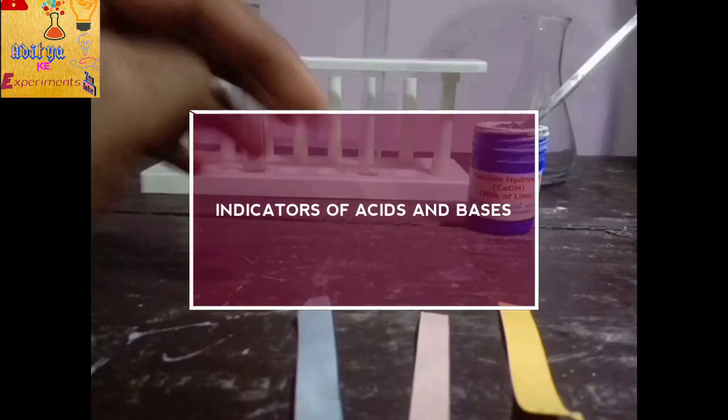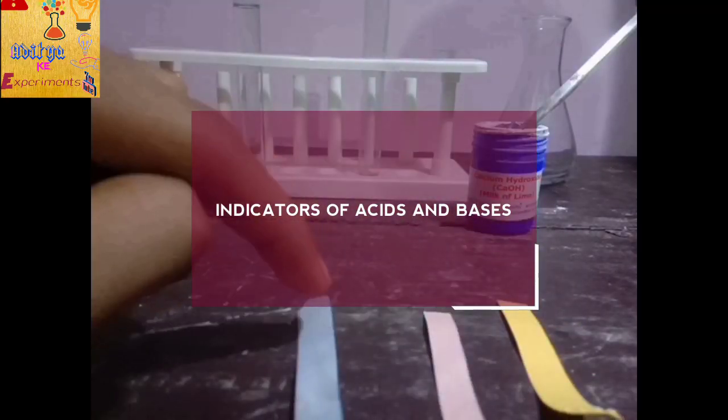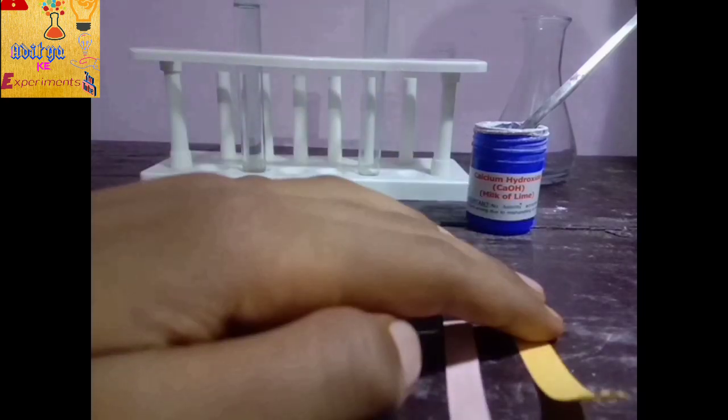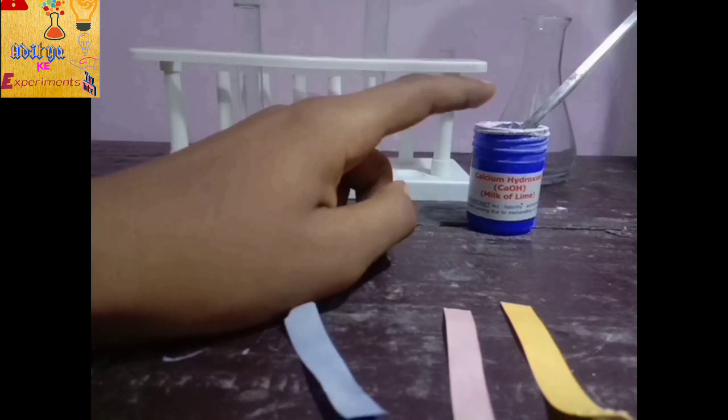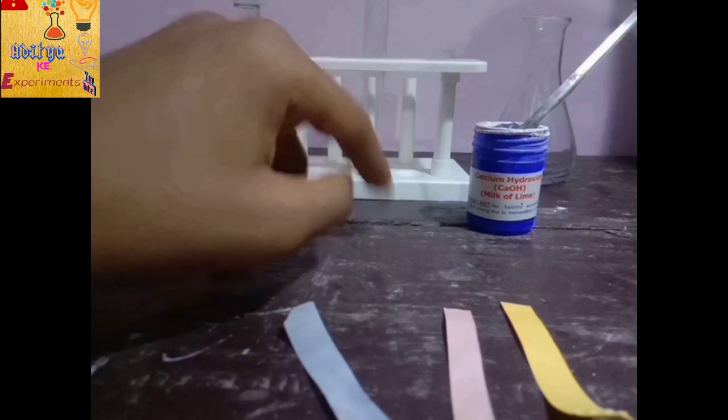Hello guys, today we have three different types of indicators: blue litmus, red litmus and universal indicator. So let's check them out with acid and base, that is calcium hydroxide, what change will occur. So let's do that.